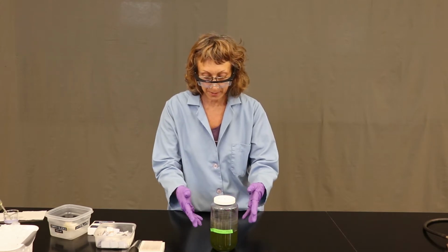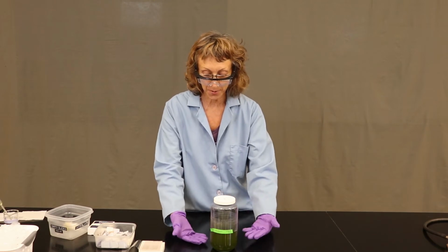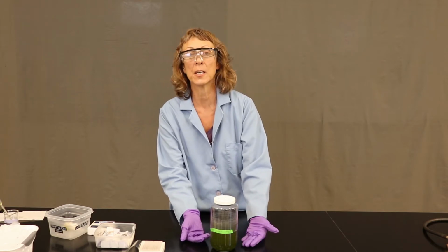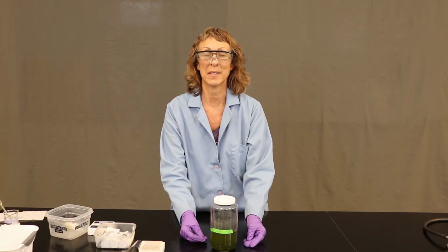But we get this little photosynthetic organism from this nice jar here that's basically full of sort of pond scum water. You can see that it's greenish in color, right? There's a lot of chlorophyll in here. So I'll show you how we make a slide of this.